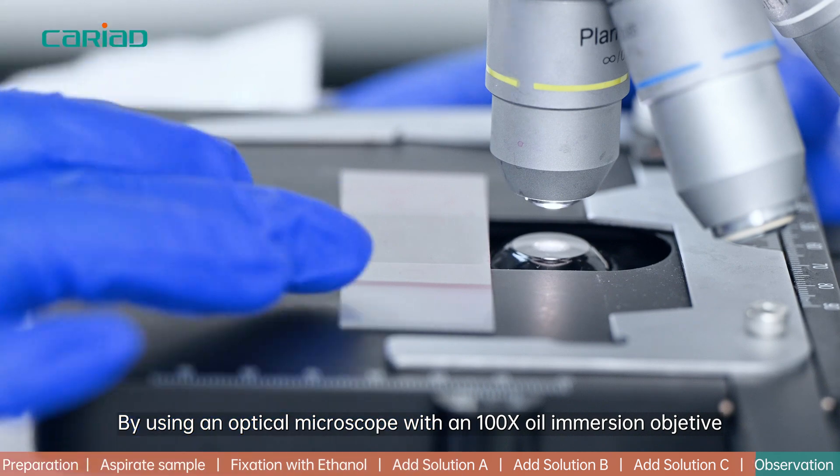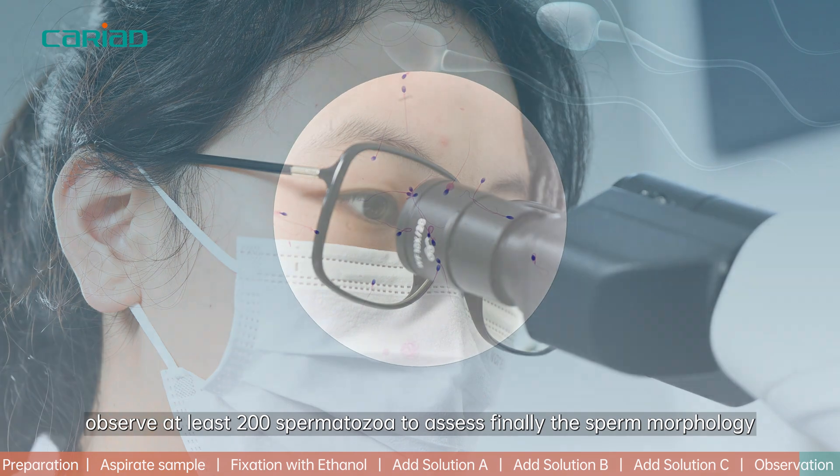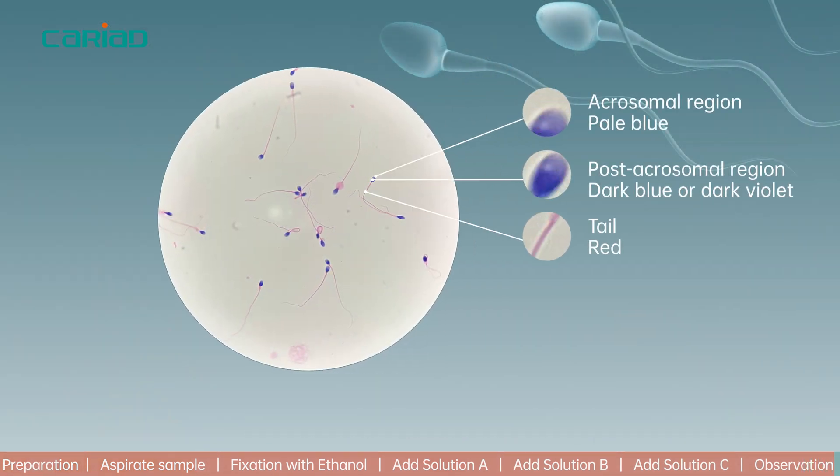Step 7: Using an optical microscope with a 100x oil immersion objective, observe at least 200 spermatozoa to assess sperm morphology.